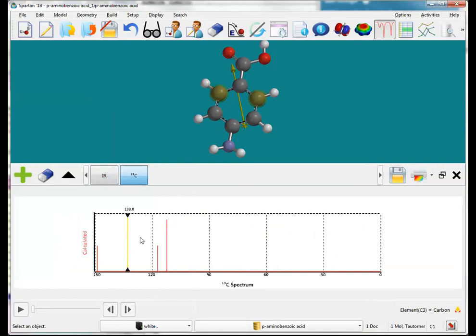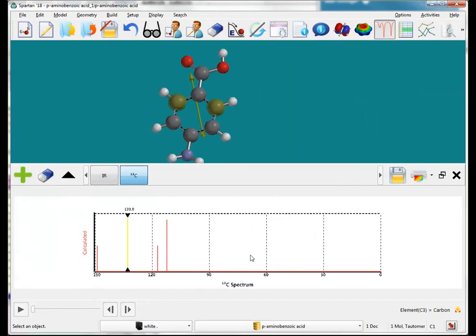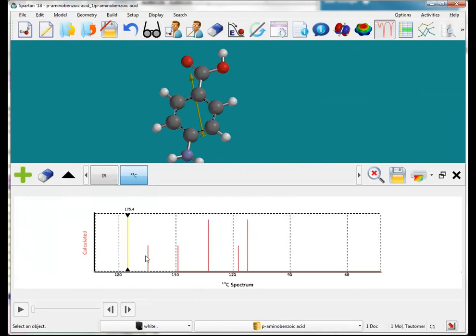There's a default range of 0 to 150 ppm. Similar functionalities like we use to move the molecule apply to my plot. If I hold the right mouse down and move right and left, I can translate. There was one set of carbon shifts that were off the range, higher than 150, but I can access it. It's the carbonyl, actually. The tables are also available here if I had experimental data as well.